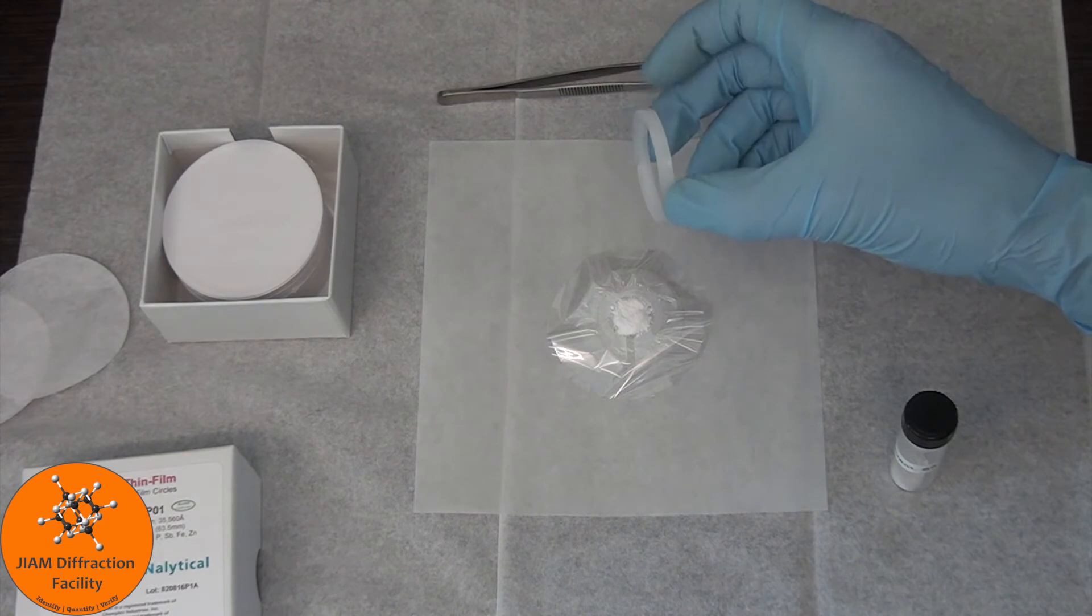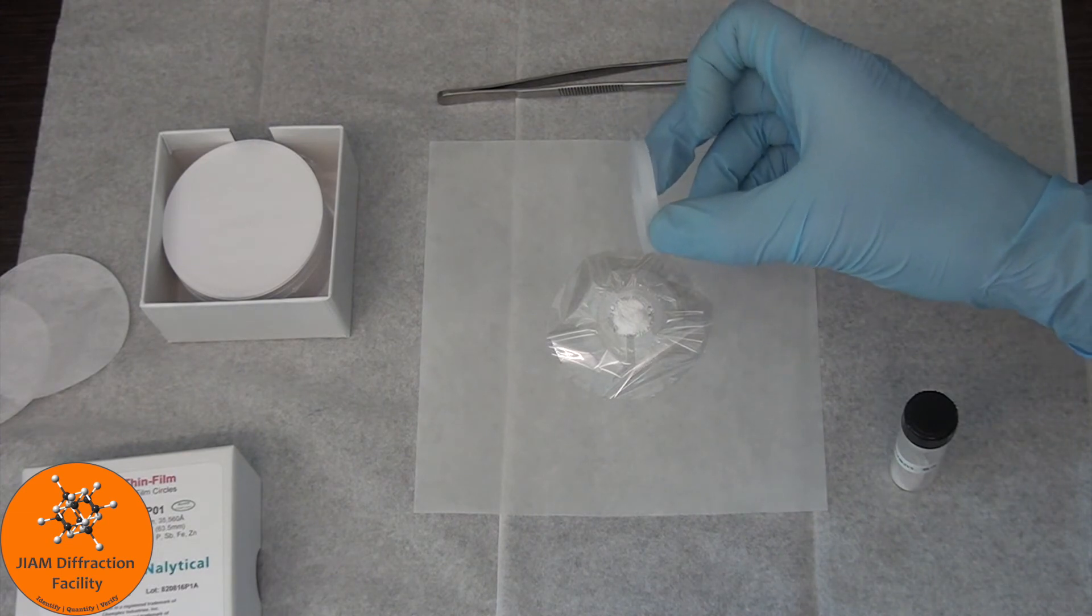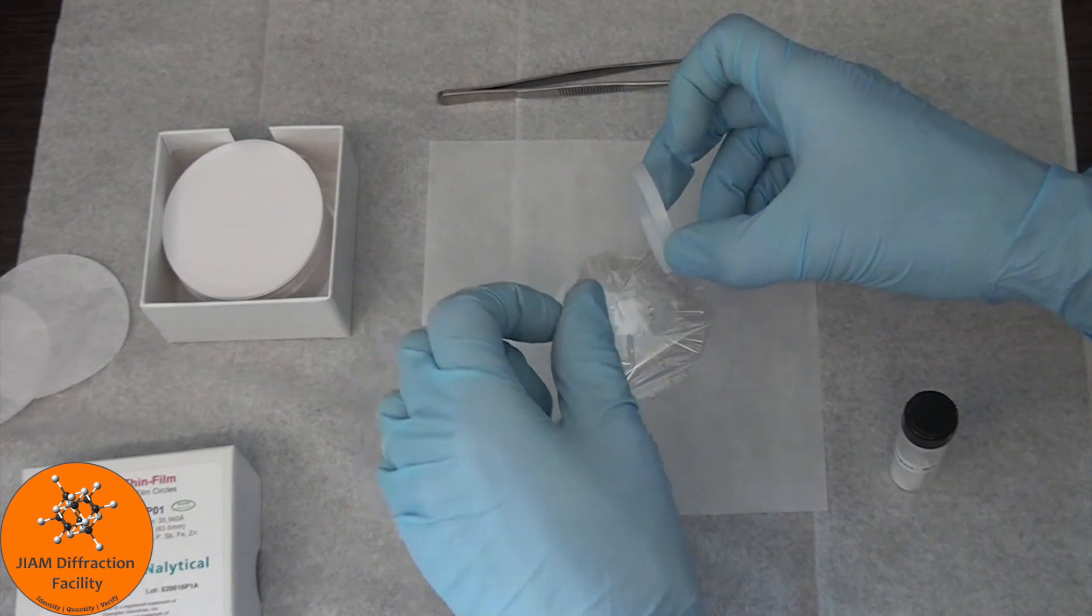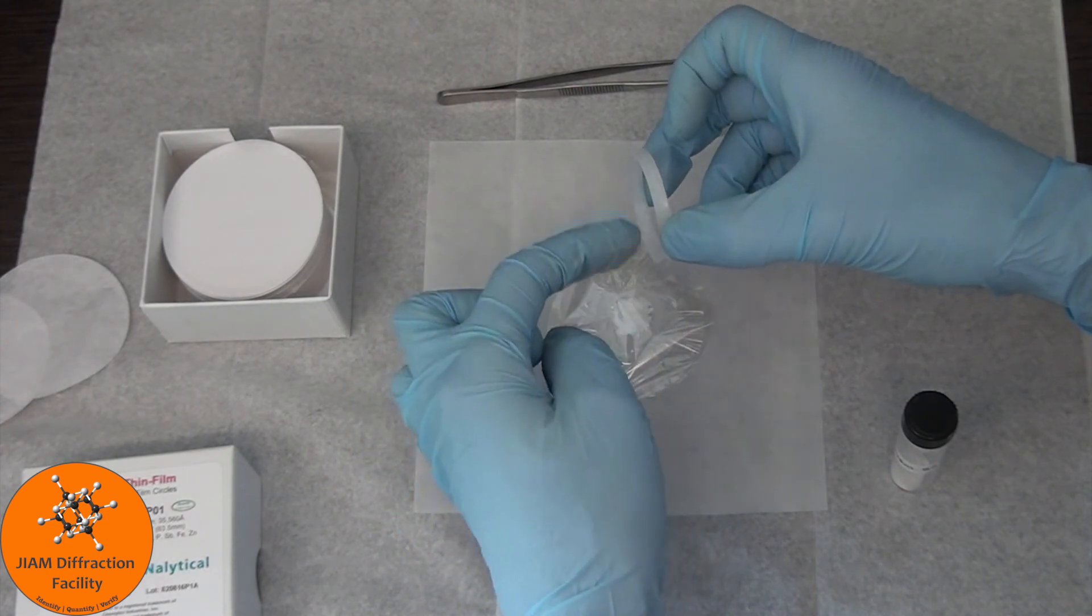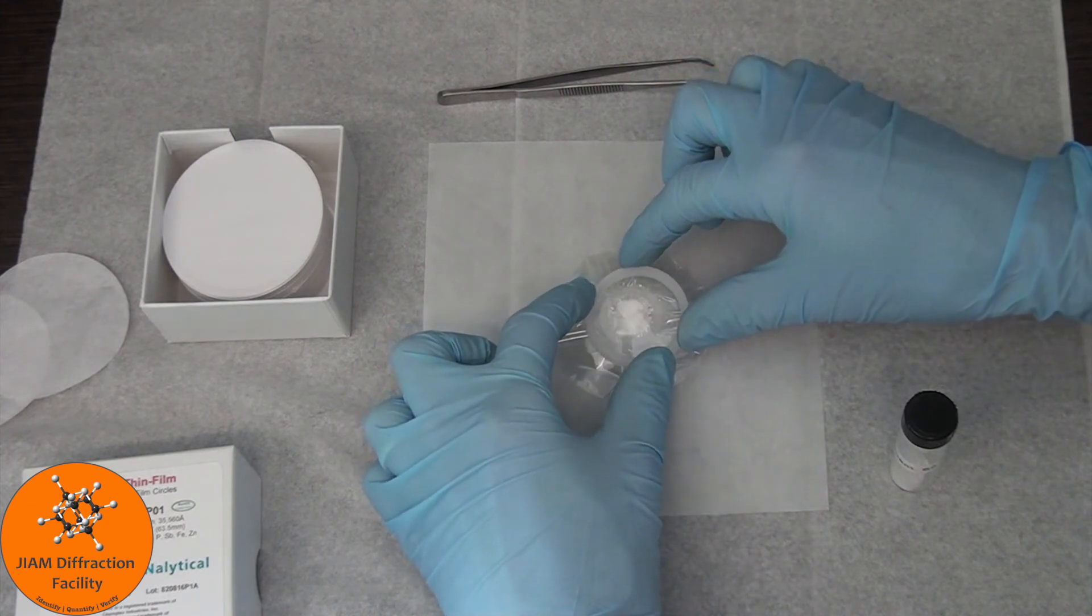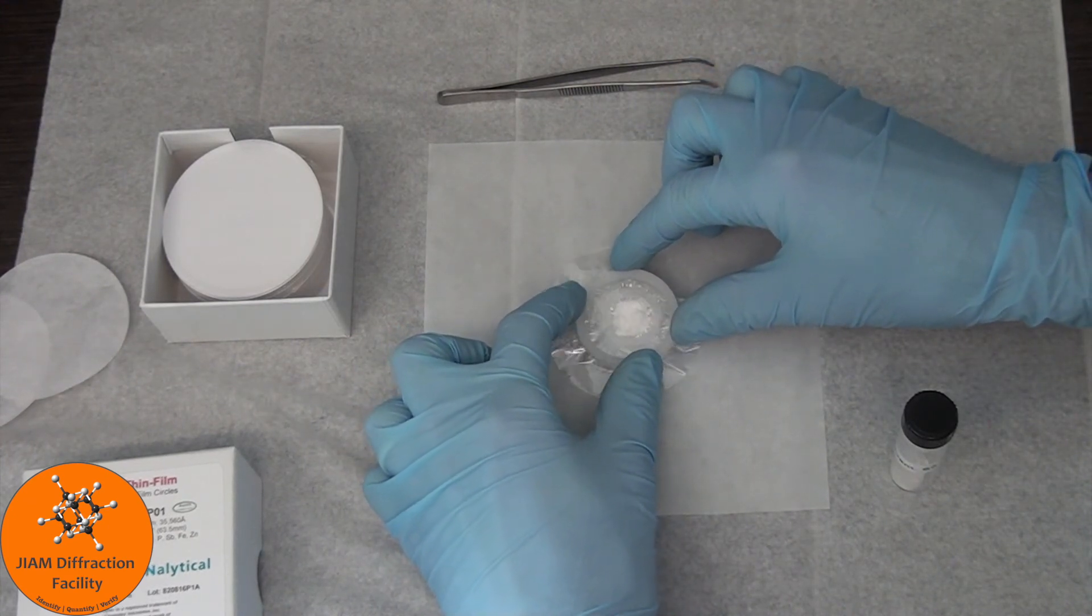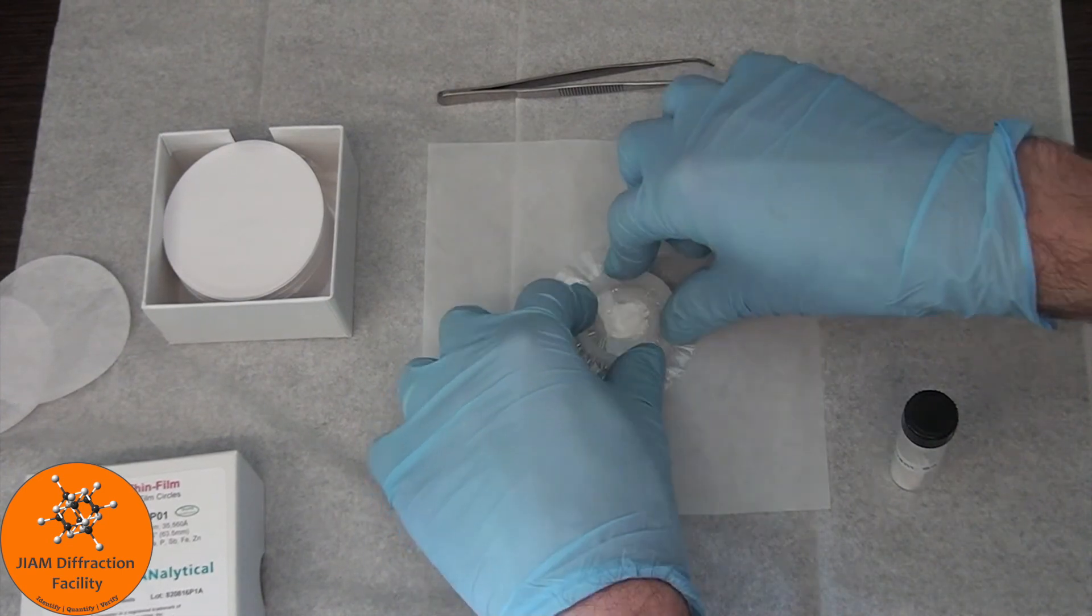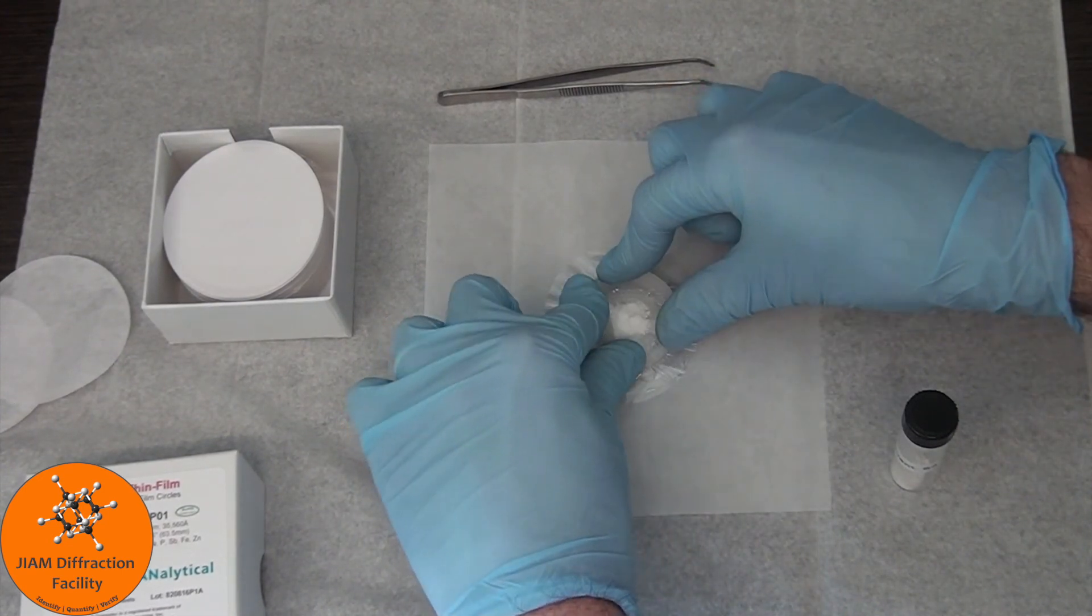Now this last piece, it might be difficult to see, but one side has a bigger opening than the other, so you want to pick the side that has the bigger opening and have that face down. And then that goes on top of the sample, and then you just press down, and it should lock it in place.